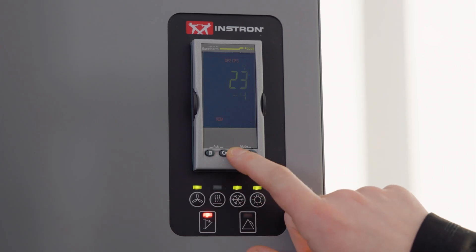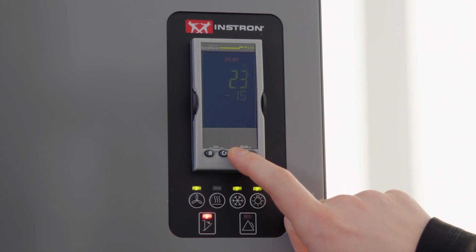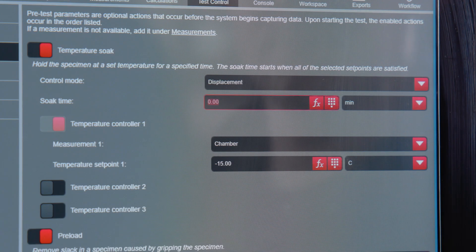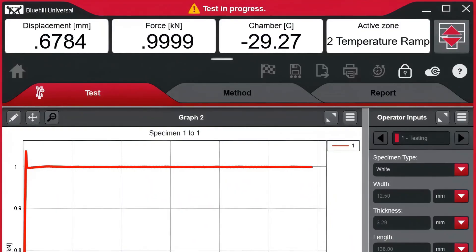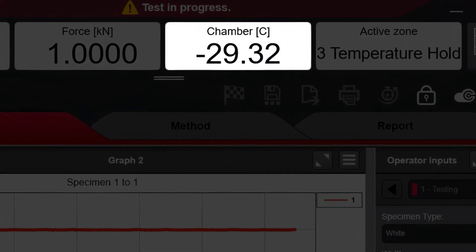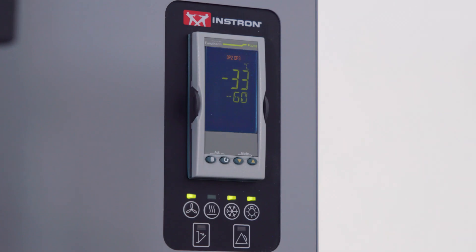There are two ways to select the set point temperature. One way is with the temperature controller on the chamber. The other is to set the temperature in the Instron software, which allows you to create a test that will ramp to a set point temperature and pre-soak for a designated period of time. It's also possible to set temperature ramps and holds within a test method. The live temperature display makes it easy to monitor the temperature throughout the test, ensuring precise and accurate temperature control for all your non-ambient testing.